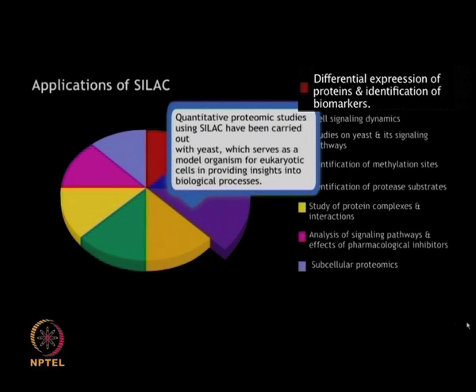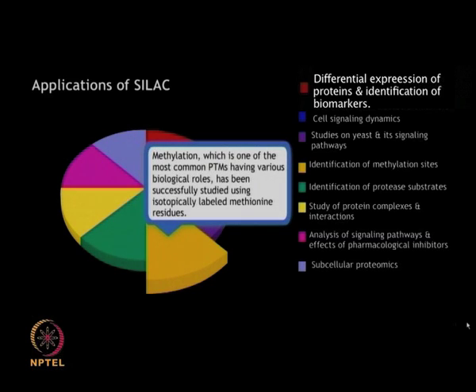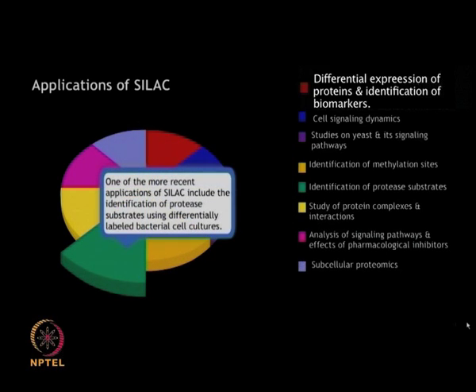The quantitative proteomic studies using SILAC have been carried out with yeast, which is a model system for eukaryotic cells, to provide insight into various biological processes. Methylation, which is one of the very common PTMs having various significant biological roles, is successfully studied using isotopically labeled methionine residues.